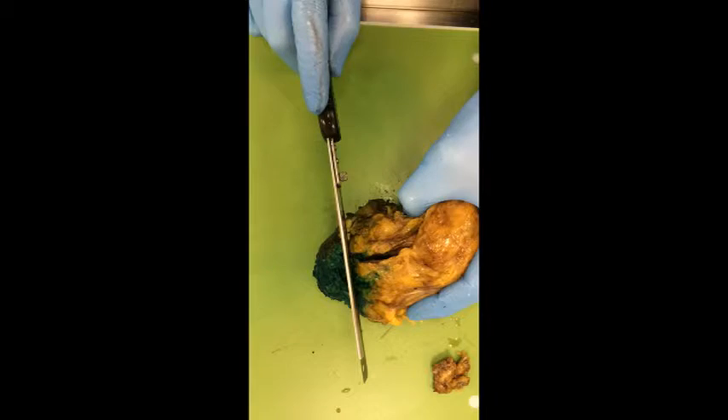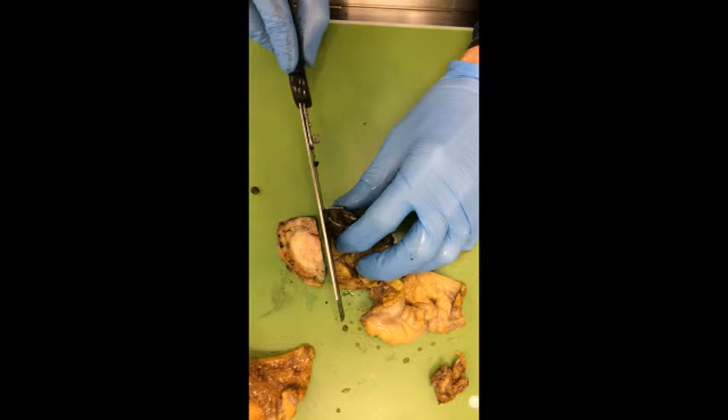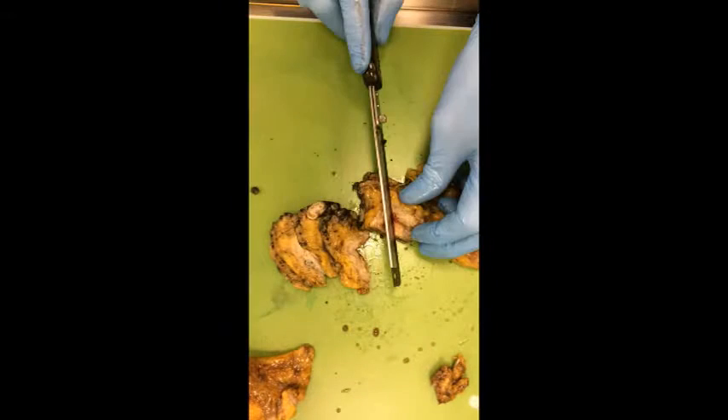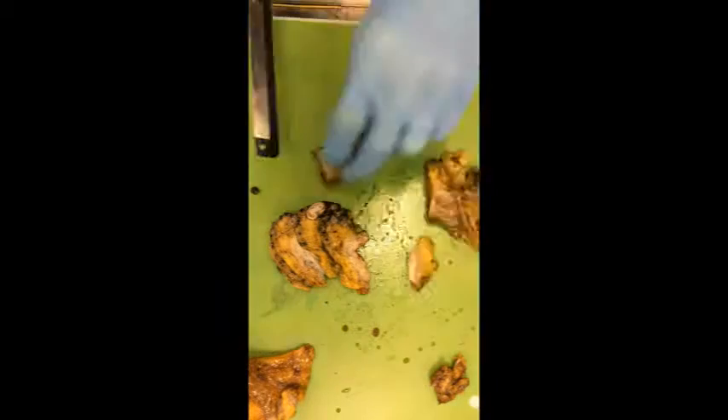Remove the prostate from the bladder and bisect the bladder into left and right sides. Then take parallel sections up the bladder to the level of the dome and take a perpendicular section of the dome. Then slice the serosal fat looking for lymph nodes. Here is the urachal remnant — a fibrous strip.